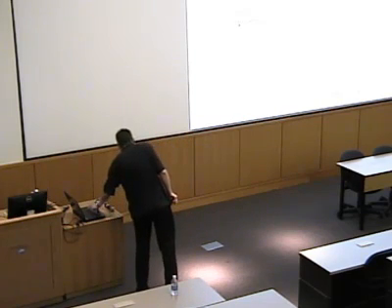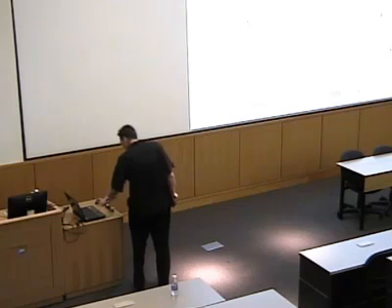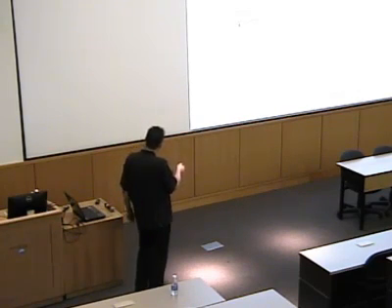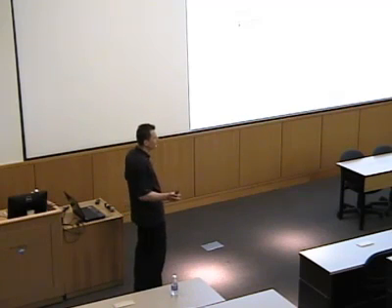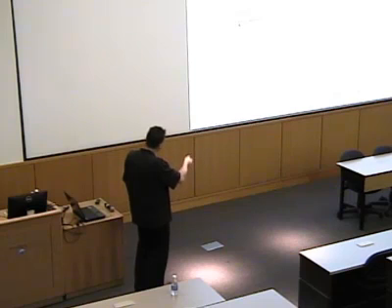So back to this picture here, right? Everything has to be orthogonal to each other. And if that's not fulfilled, then there's no MCD intensity. So if, for example, let's say this transition is X polarized, this transition is Y polarized, but they cannot couple in Z direction, then there will be no intensity. If these two states can couple in Z direction, but both of them are X polarized, there will be no intensity. If this couples in Z direction and this transition is Z polarized, there will be no intensity. Right? So everything has to be orthogonal, and only if that is fulfilled will MCD C-term intensity arise.